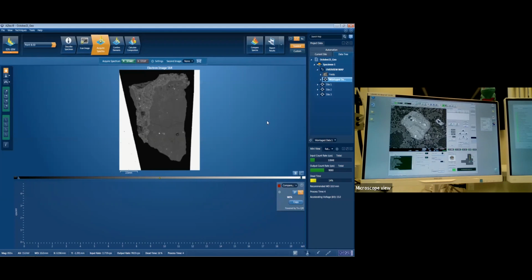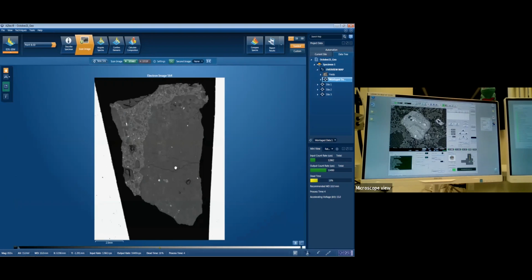That's just the Apatite, the big overview map. So we've been up here in this corner so far. Where would we like to go next? You can either ask us directly or you can put it in the chat and we will go there. I'll give everyone a few moments to decide, and otherwise I'll leave it up to Lorelei.